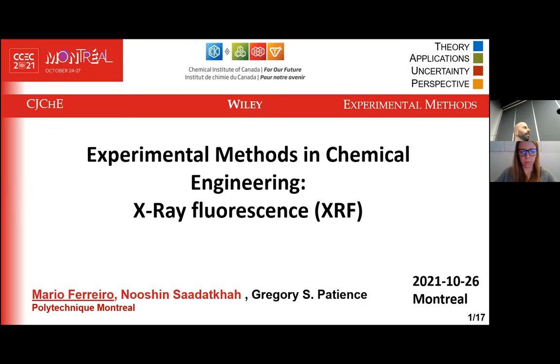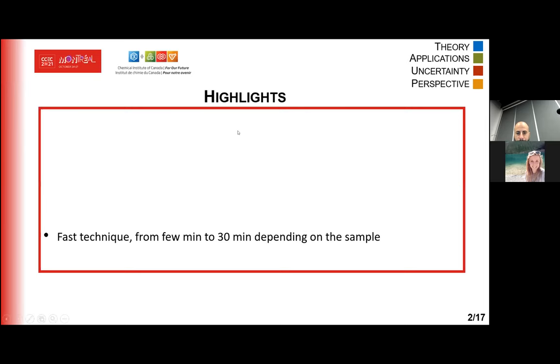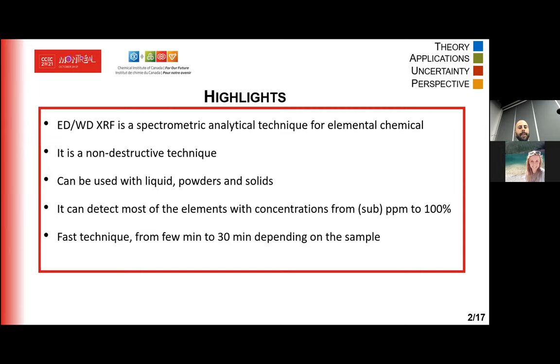Okay. Hello, everyone. I'm going to present X-ray fluorescence for chemical analysis. This technique is a spectrometric analytical technique that uses X-rays to analyze the basic elementary components of matter. So it doesn't analyze compounds, it's just the basic elements. It's a non-destructive technique, so you don't lose your sample.